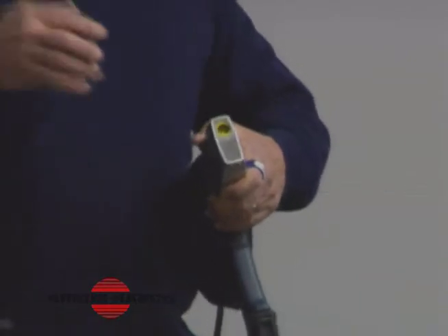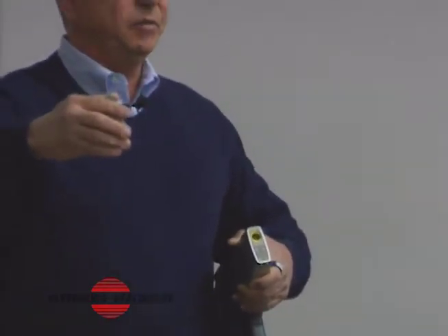At about half of that 10 feet, we can't even measure it. So the 10 feet is quite a fudge factor, if you will. And then shielding, as much as possible, you want to shoot into high-density samples. Cover the window completely as much as you can. So they're not always going to be able to do that. Sometimes you have some smaller samples and things, but that's where the test stand comes in.